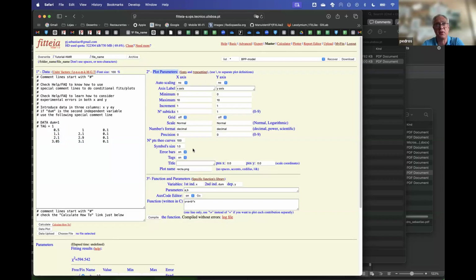That depends on the software, of course. In Origin, you just select the data set that you want to plot, and then you click a button and it produces a plot using some defaults predefined by the system. Then you can customize your plot by changing its parameters. But the plot parameters have to be set somewhere in the system, and I'm sure that you have tuned them at a given moment when dealing with your data.